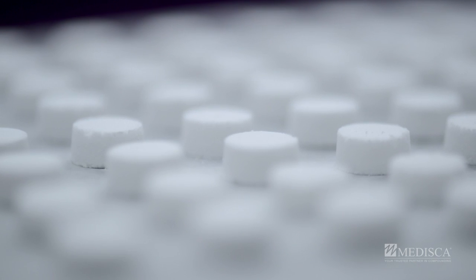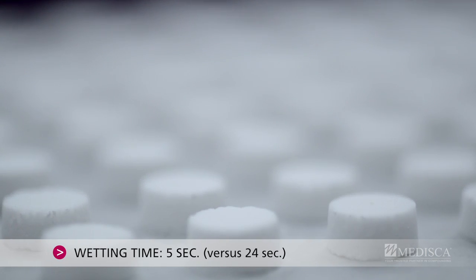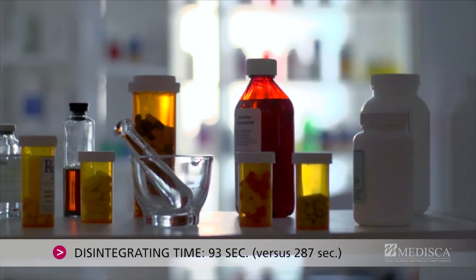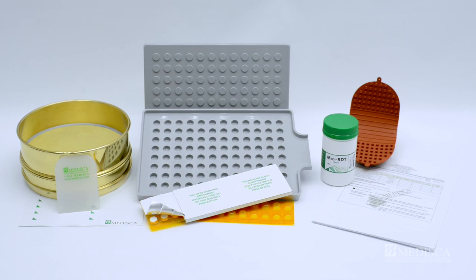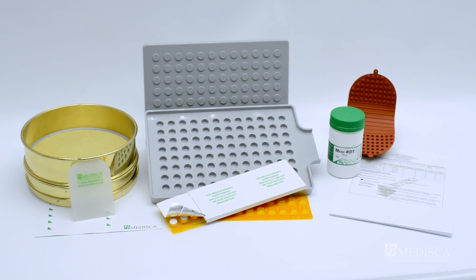Modiska's new RDT formula provides significantly faster wetting and disintegration times compared to similar products on the market. Let's start the process of preparing rapid dissolve tablets with our RDT kit.